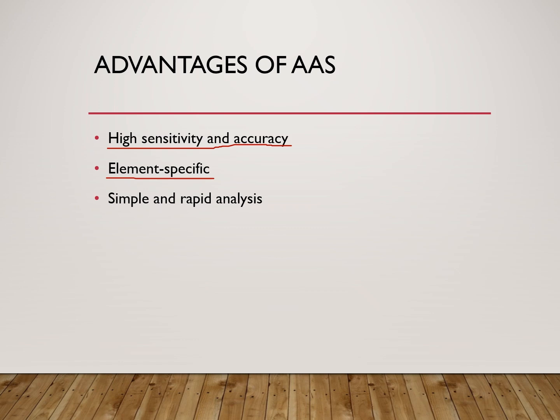It is a highly sensitive technique, so it can analyze minute concentrations and trace elements, and it is a simple and rapid technique that gives accurate results.